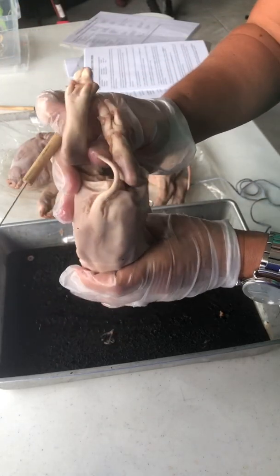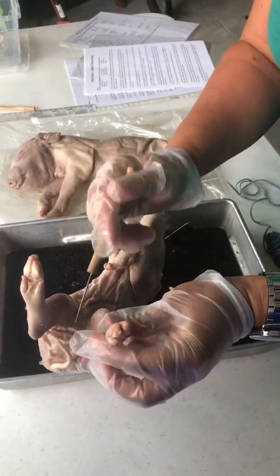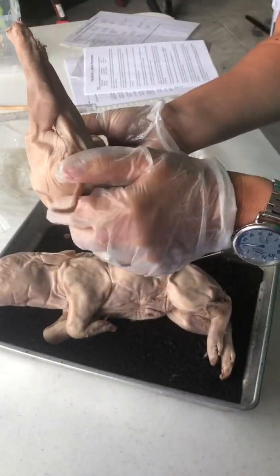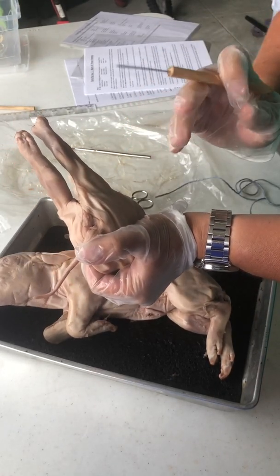And you can also look at the back to see the sac. For the female, in order to sex, you're gonna look on the back and you can see the urogenital opening right there.